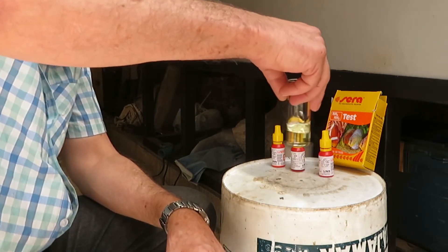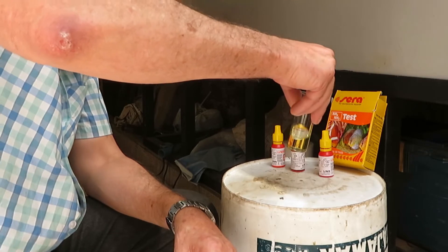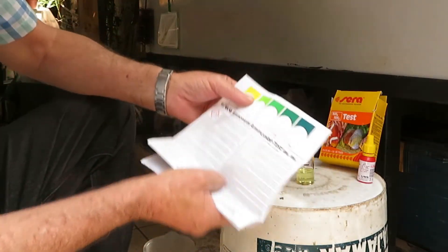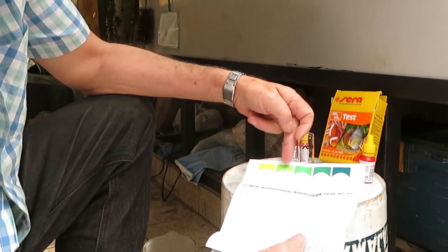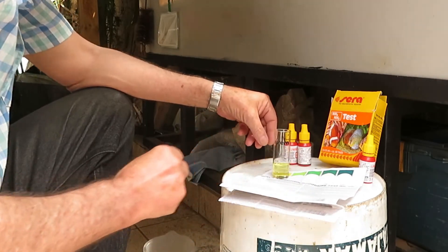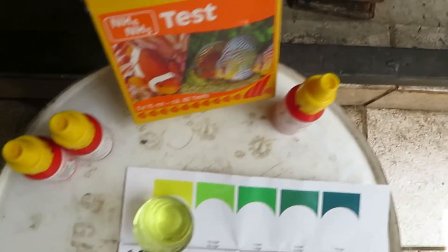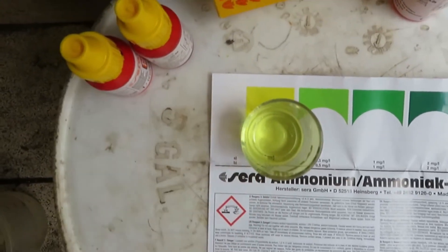As you can see, the liquid has changed colour — it's no longer transparent and colourless; it now has a yellowish hue. The instruction sheet includes a colour chart, and we have to compare the colour of our liquid with that chart. The instructions say clearly that we must look at the colours from above, placing the flask in a shaded area.